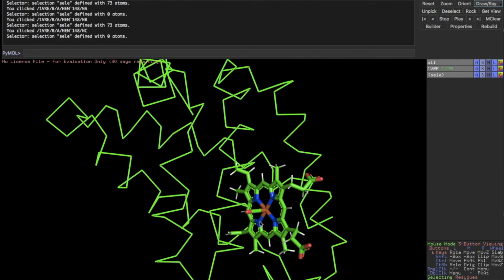And now I'm going to also click on the blue molecules, which was also asked for. And I'm getting these weird letters, NC, NB, ND, NA. And that's because there's 4 of them, so they've labeled them 1, 2, 3, 4, or A, B, C, D. But the letter is N. And so, we could figure out, okay, what atom is represented by the letter N.